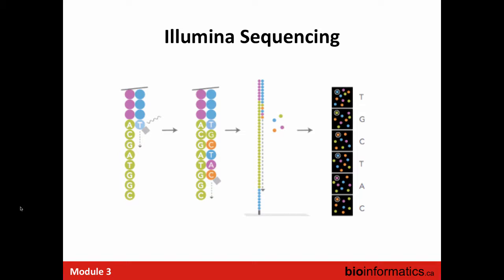But what happens is that the nucleotides being added to this growing molecule of DNA are labeled with a fluorescent tag with one of four colors.